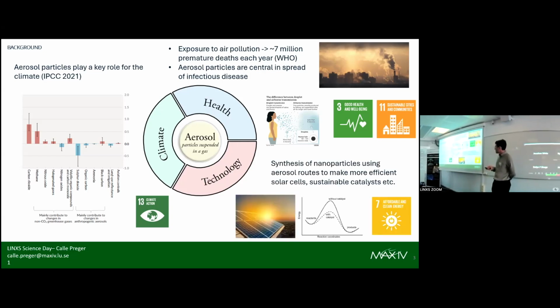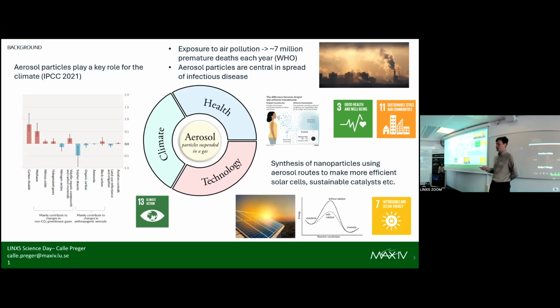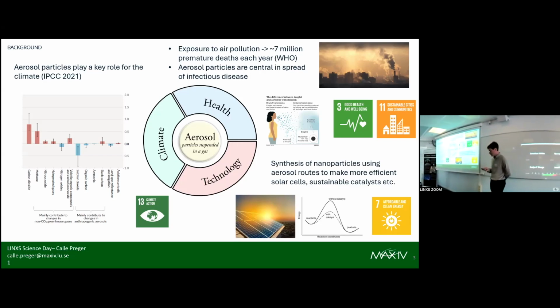But this talk will be mainly about synthesis of engineered nanoparticles that we can generate using an aerosol route. But it's also possible, I should emphasize that, to aerosolize particles from a colloid to study free particles without any substrate.